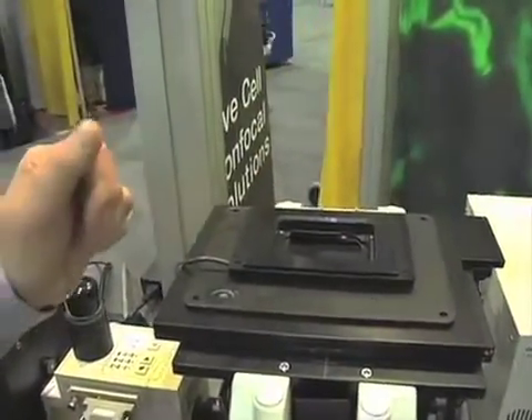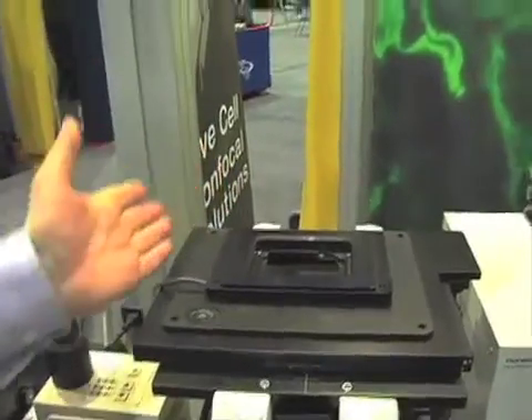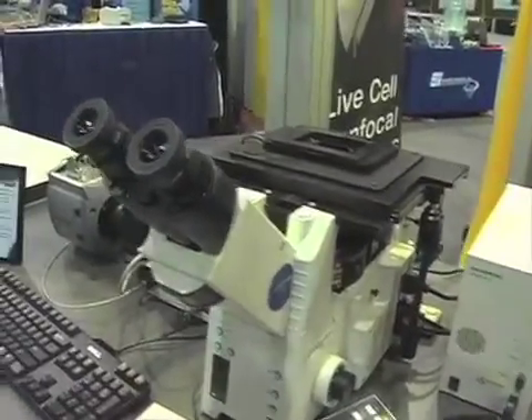The specimen sits here. Normally in our systems this is capable of taking a 35mm Petri dish, a stage top incubator, or slides. This is actually a piezo stage, which allows us to make very small movements in Z with about 3 nanometer resolution and about 100 microns of movement. There's also a 500 micron version available. This sits not only on Olympus microscopes but on any customer's preferred infinity-corrected scope — that would include Nikon, Leica, and Zeiss as well.